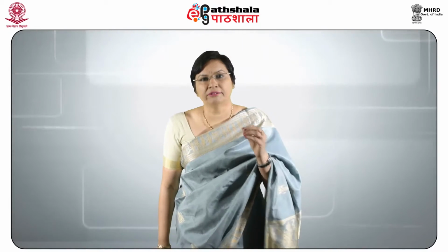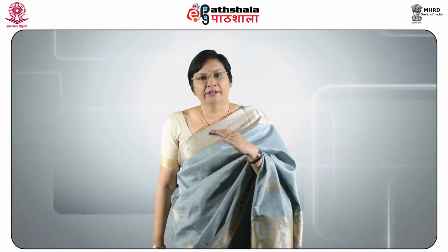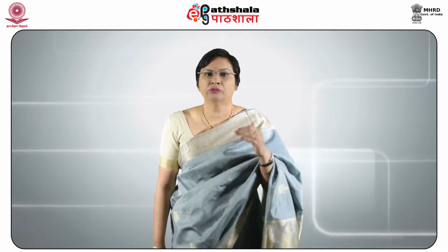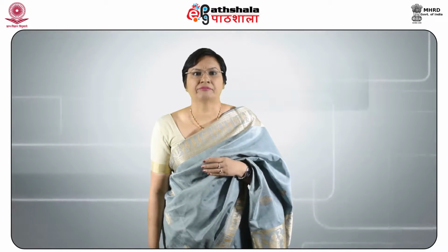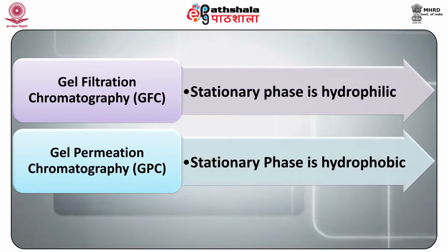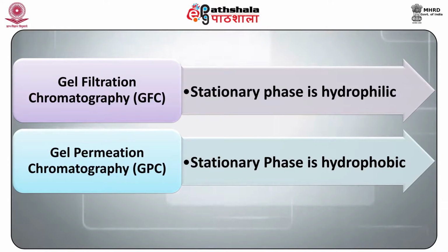Molecules of relatively smaller size are decelerated in their progression in the column because they can pass into the stationary mobile phase within the pores of the packing. This method is referred to as gel filtration chromatography when the stationary phase is hydrophilic, and it is referred to as gel permeation chromatography when the stationary phase is hydrophobic.